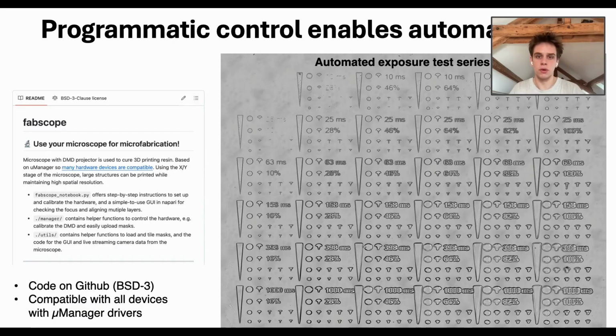So you're also able to, for example, do exposure test series on a single slide, where with a classical approach you would have to do multiple exposures and repeat the whole protocol a couple of times. And I think there's a couple of interesting follow-up questions here. For example, to use the image feedback also to steer the stimulation intensity to optimize the exposure in real time, with feedback.